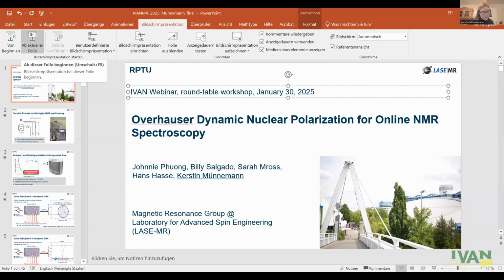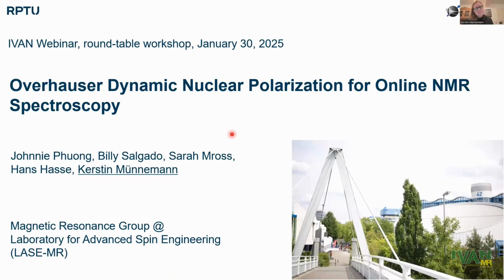Thank you very much. I will tell you something about Overhauser dynamic nuclear polarization, which might be useful for online NMR spectroscopy. We are just starting a little bit in this field, so our results are not yet as perfect as what we have seen already.